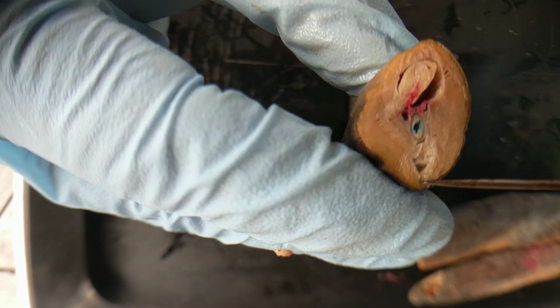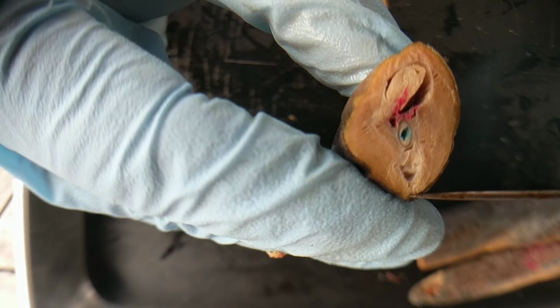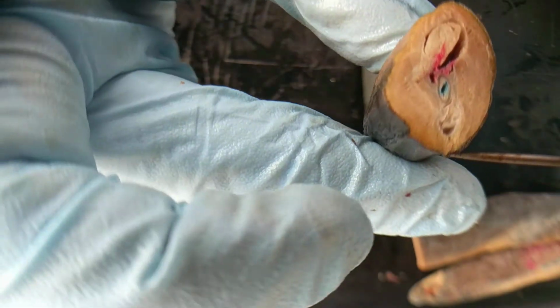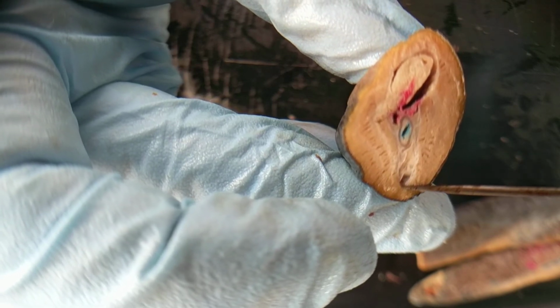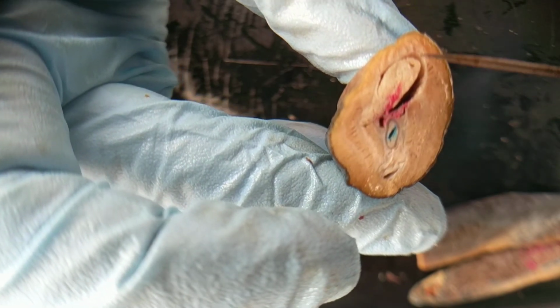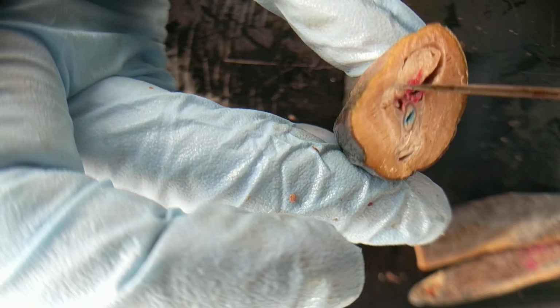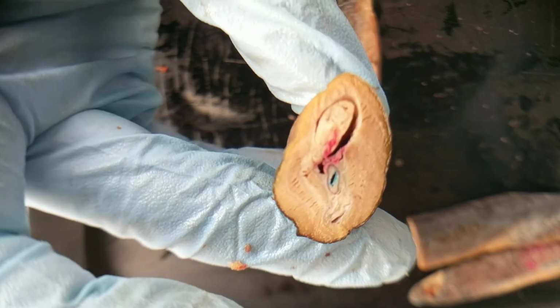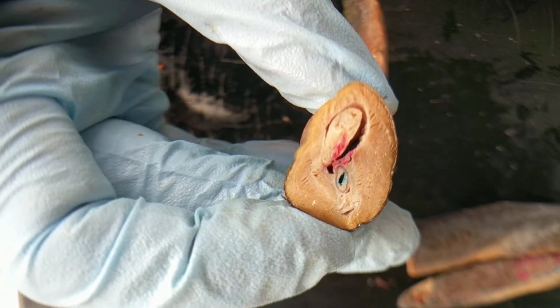And then if I pull up a little bit, you can see that hollow. Sometimes the nerve cord's called a dorsal hollow nerve cord, because the nerve cord has some fluid inside. That hollow actually means there's a fluid cavity. So if I pull it up, there it is. That's the dorsal hollow nerve cord. Notochord below it, dorsal aorta below it, myomeres on the side, and then you'll probably see the intestine. I think that's probably the intestine there, and this dense tissue is the liver in the lamprey. And I think that's everything.